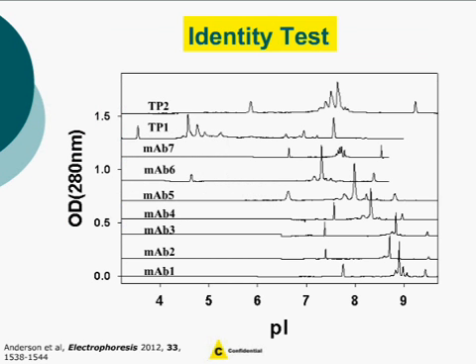So I'll start off by talking a bit about product identity. Biological product development regulations stipulate that product identity testing is required for a site that produces multiple different products, and that the identity test should be highly specific and be based on unique aspects of the product's particular protein molecular structure. Traditionally, ELISA is often used as an identity test for biological products. This technique is usually time and labor intensive and often relies on several critical reagents.